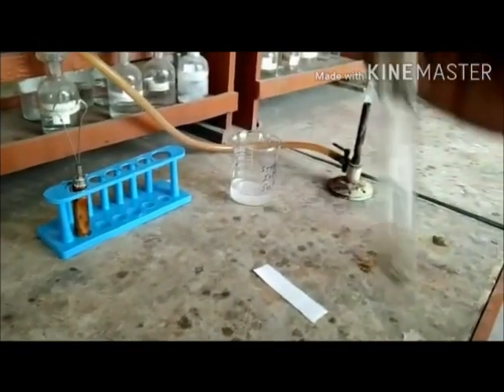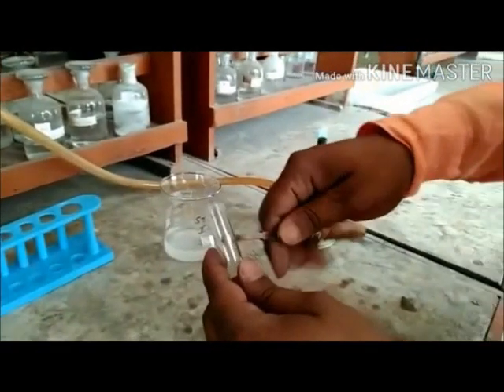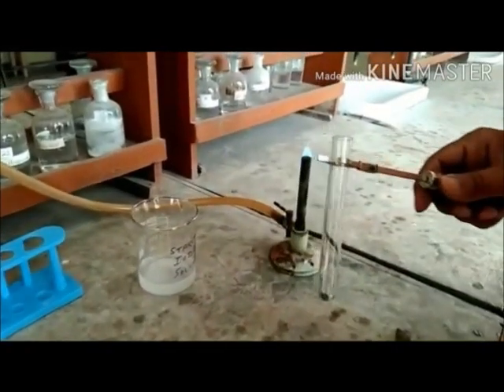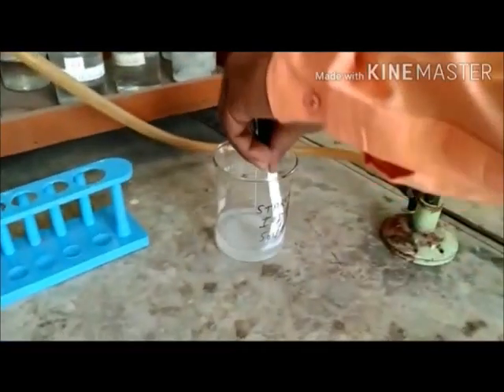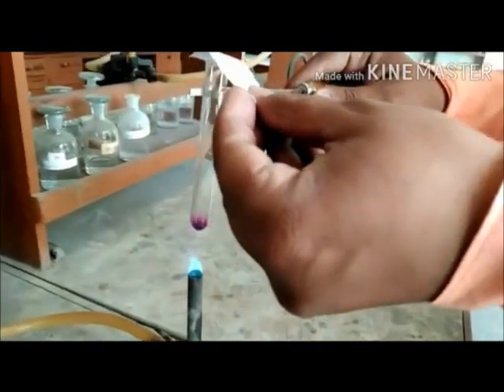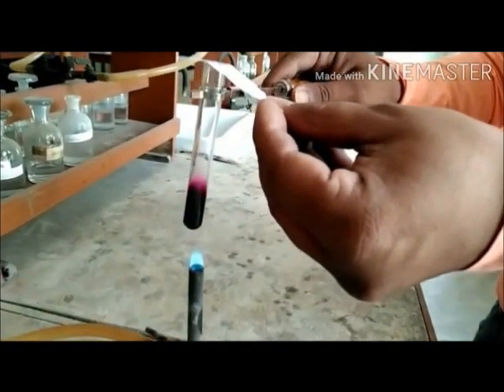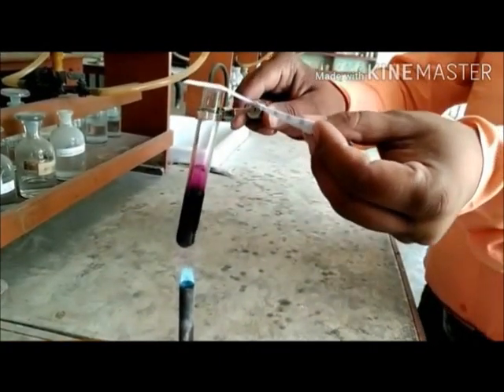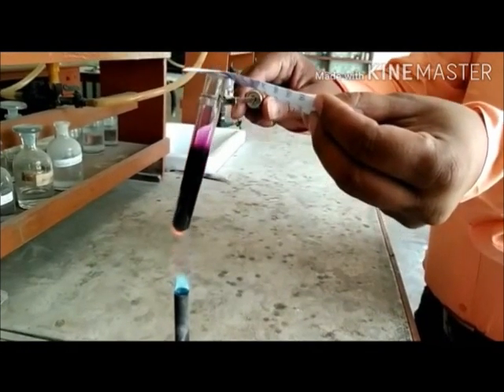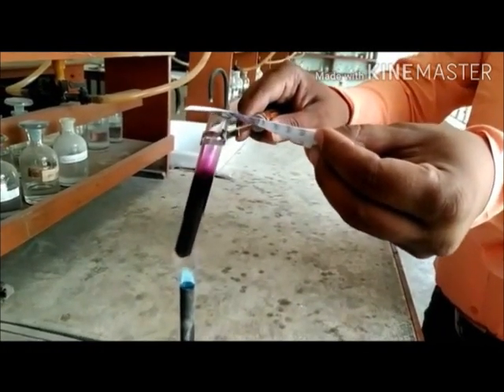Holding this test tube with a test tube holder, we place it on the Bunsen burner. Along with it, we take the strip of paper and dip it in starch iodide solution and place it on the mouth of the test tube. We observe the evolution of violet coloured vapours, which turns the paper dipped in starch iodide solution blue.